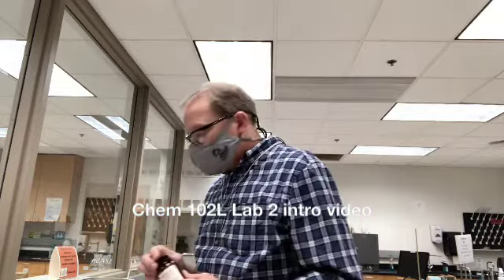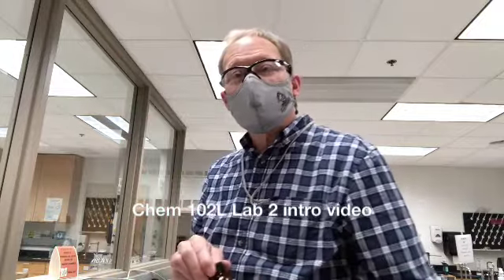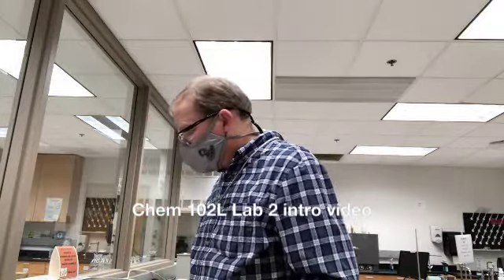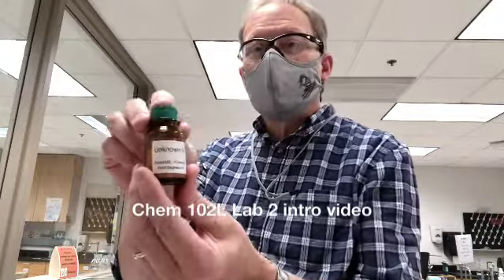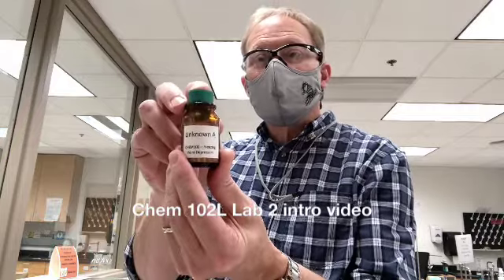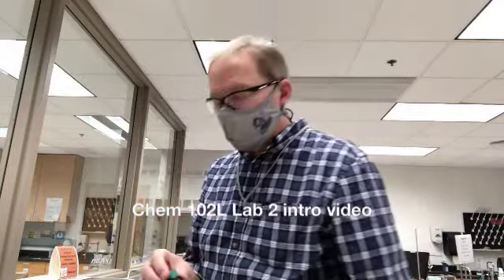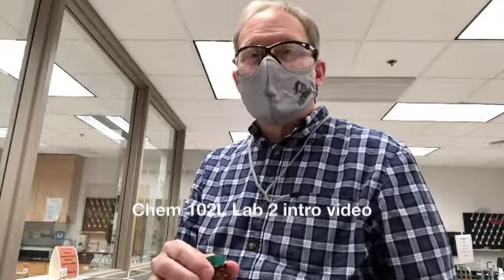And so into our lauric acid, once we have measured its properties, we're going to mix a little bit of what we're calling an unknown compound. That is, it's not known to you, and you're going to figure it out in lab. This is a little bit of a detective challenge.